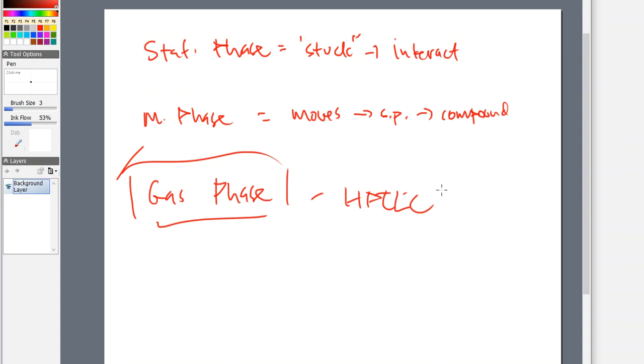So we need to dive a little bit deeper into this concept of what a gas phase is all about. Talk a little about it. What does it do? What does it interact with? Why is it there? And then really describe why we don't see those in the other chromatography types of exercises or protocols or lab procedures that we will use within the system.